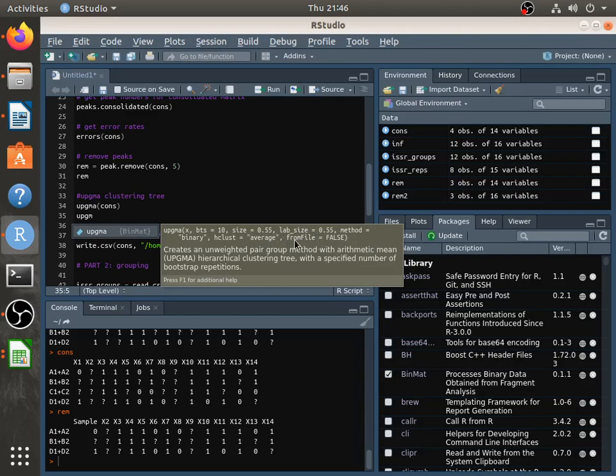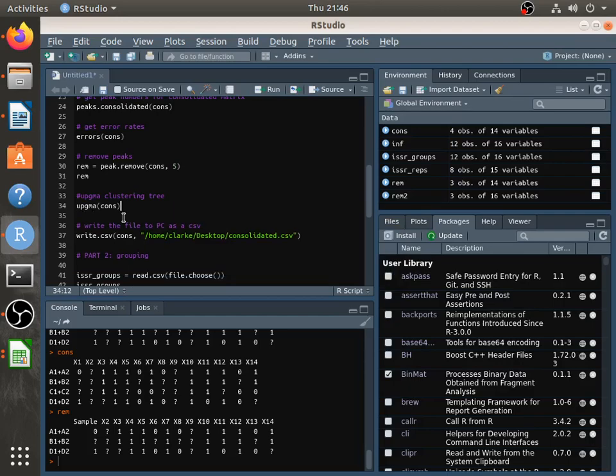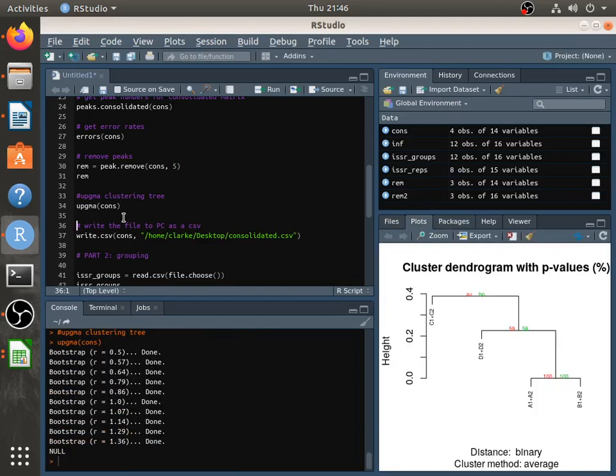I'll explain what this from file means a little later. It's set to false now because this consolidated matrix hasn't been uploaded as a separate thing. It's been processed right from the beginning, from that very first file. So let's just use the normal default settings for now. You would run this, and then here you'll see the output.